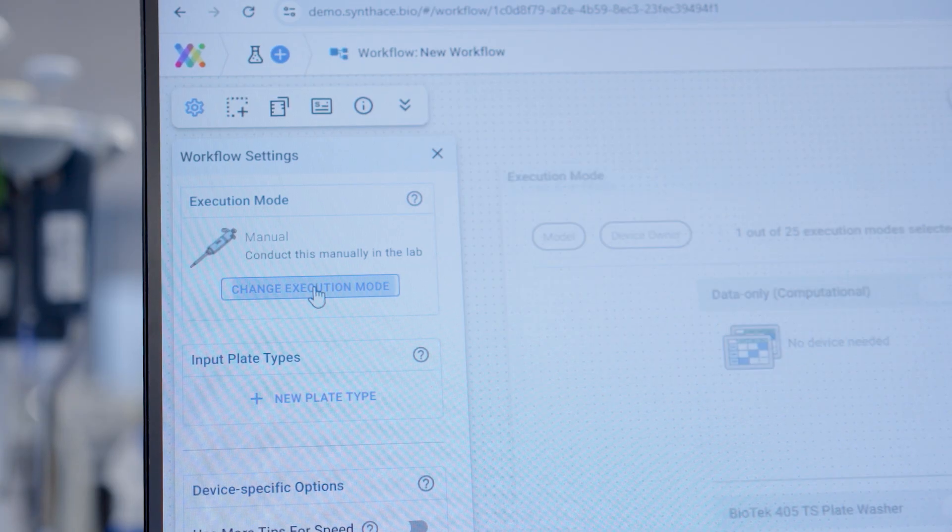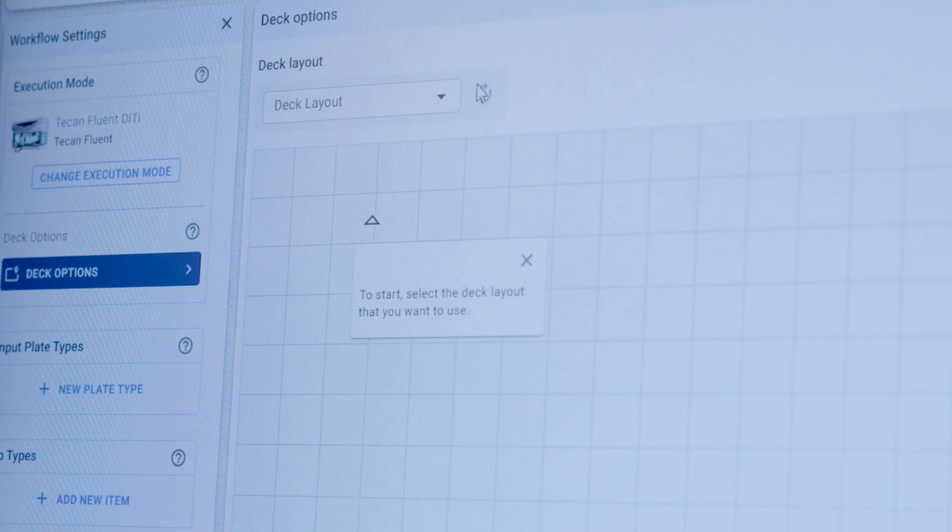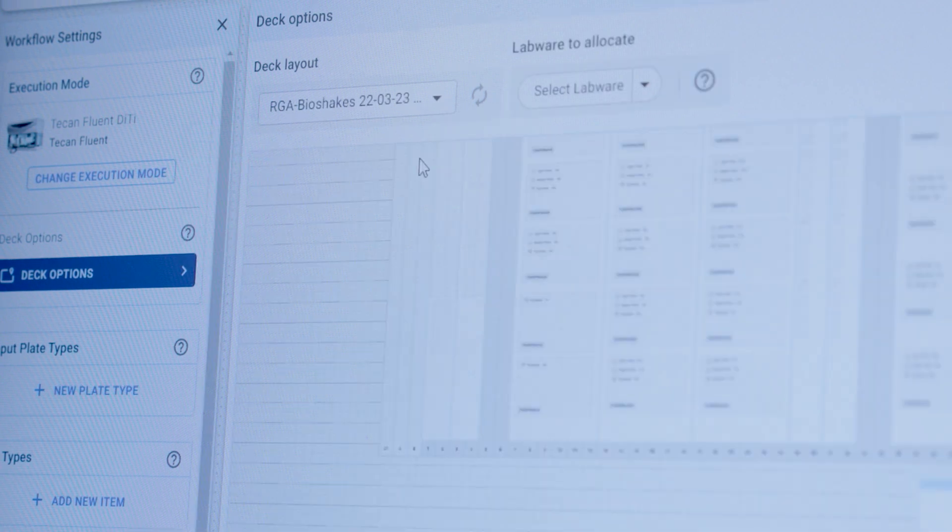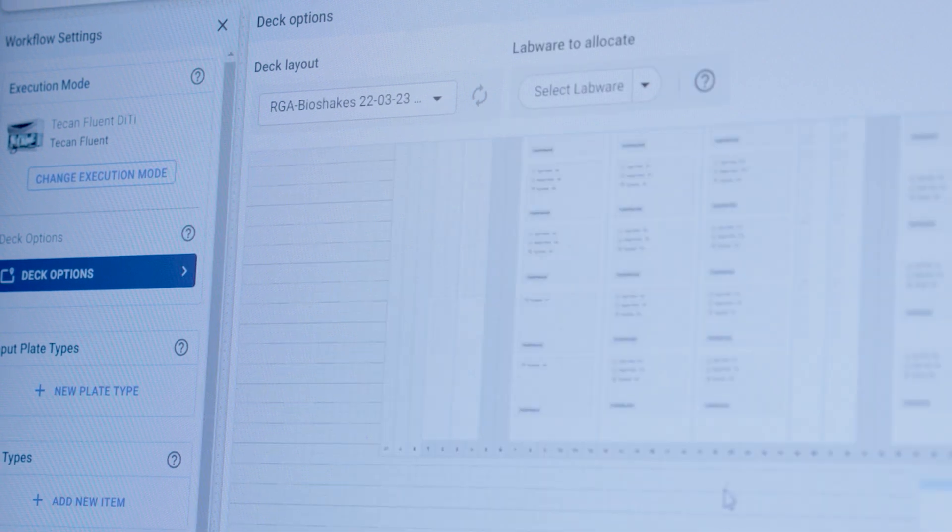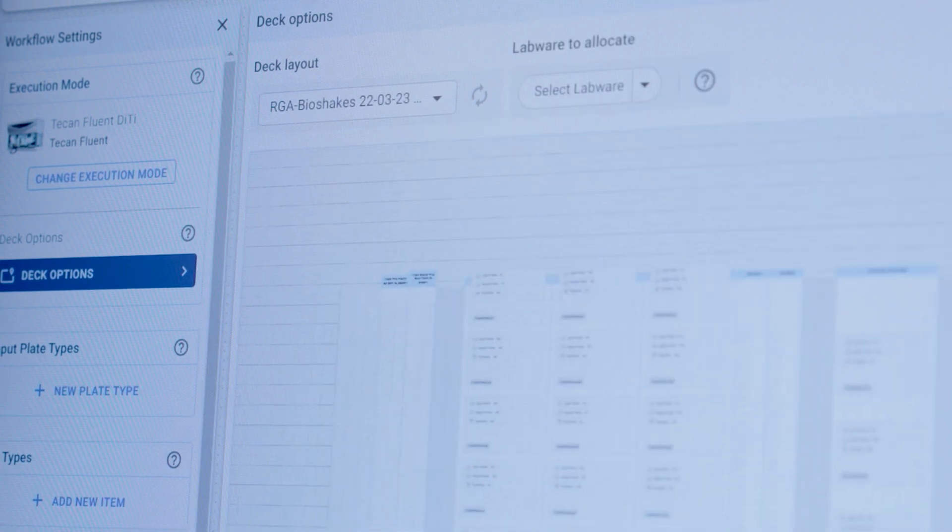Choose Fluent as the execution mode. Select a deck configuration. This should be the layout of your robot deck which matches the current setup.